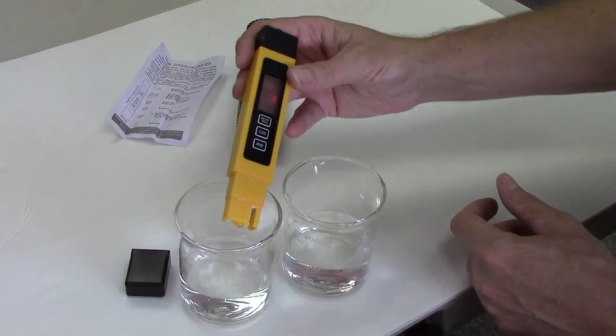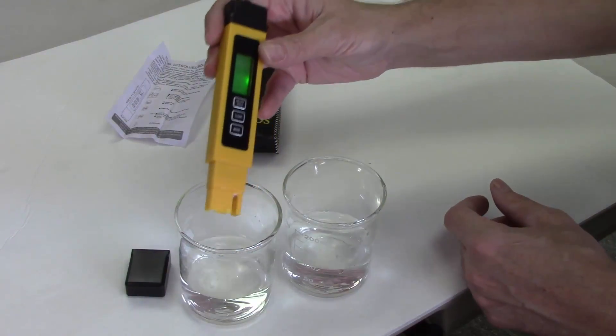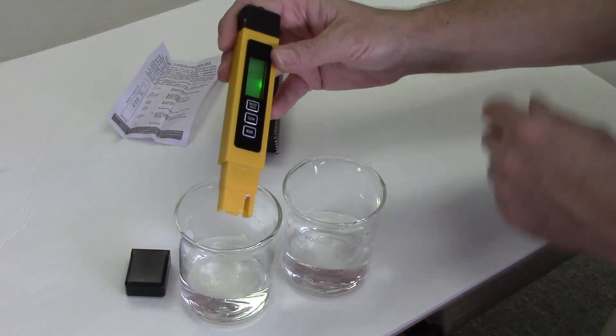The first one I put it into rang out at 219 parts per million and it turned red.